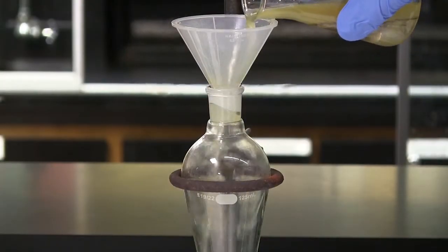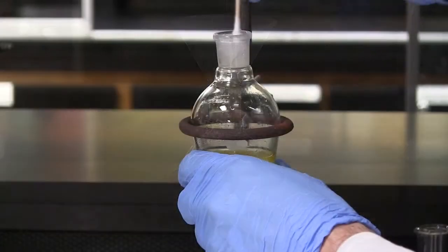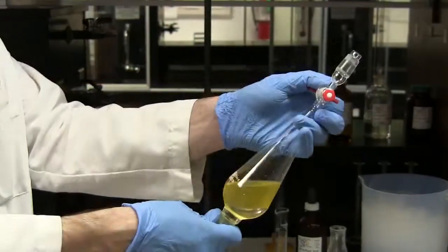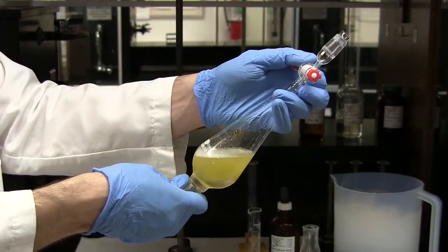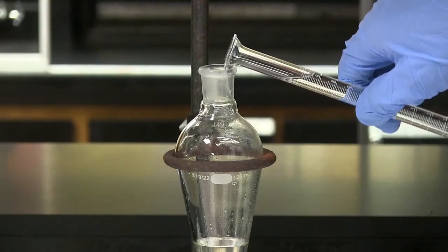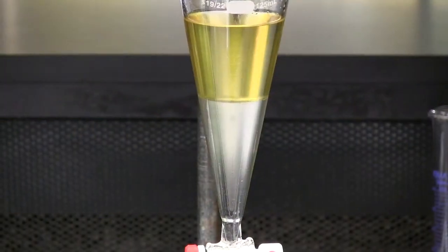Once the solution is thoroughly mixed, transfer the mixture into a separatory funnel. Rinse the flask with a small portion of ether and pour this into the funnel as well. Shake the funnel cautiously, venting frequently. Set the ether layer aside and extract the acidified aqueous layer 2 more times with 10 milliliter portions of ether. Combine all of the ether layers.